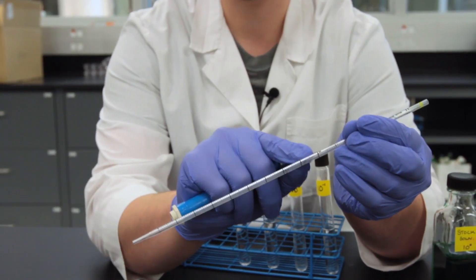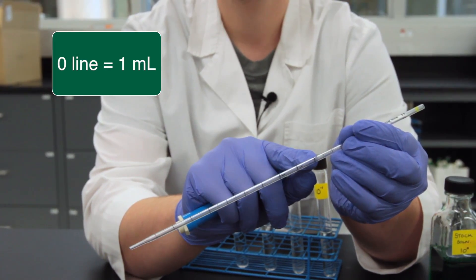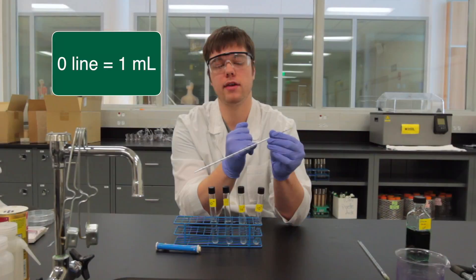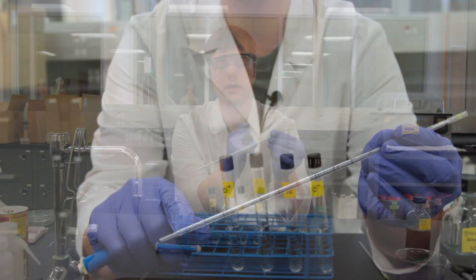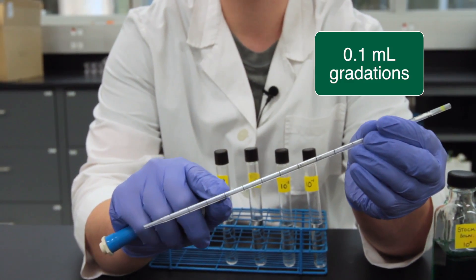The zero line indicates that if you draw liquid up to that line, 1 mil is present in that pipette. These gradations are 0.1 mil.